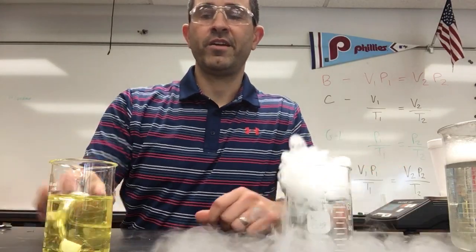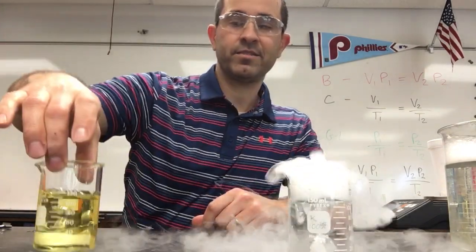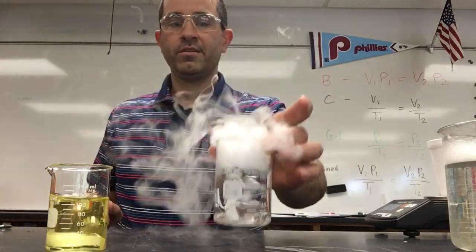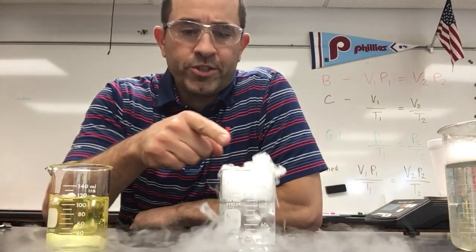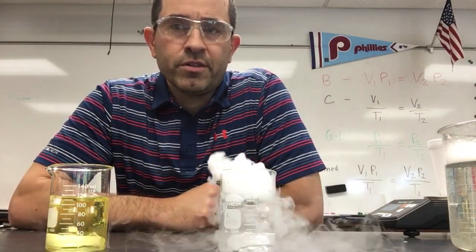Let's separate these out here. So take a look at that. Nothing coming out, no gas. What do we see here? Lots of gas. So the question is, what is that fog?